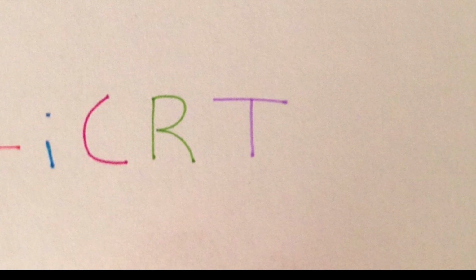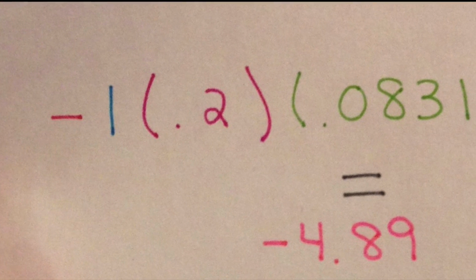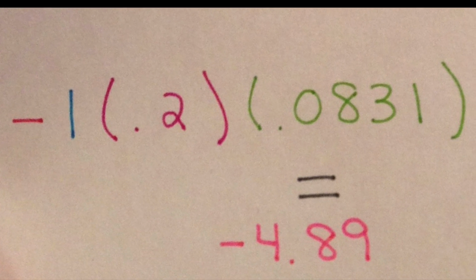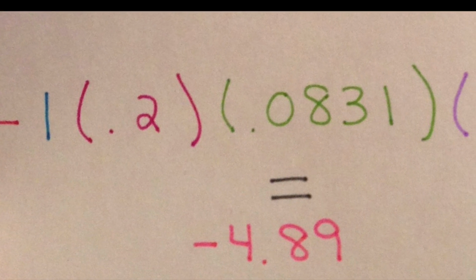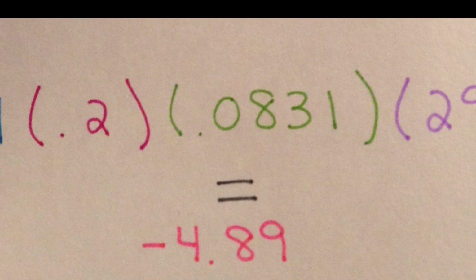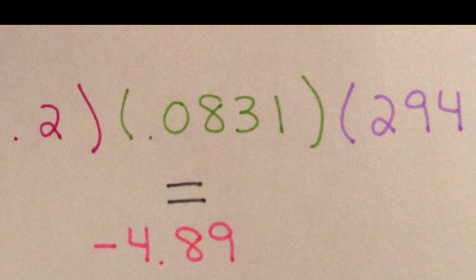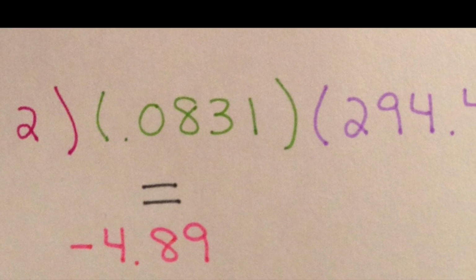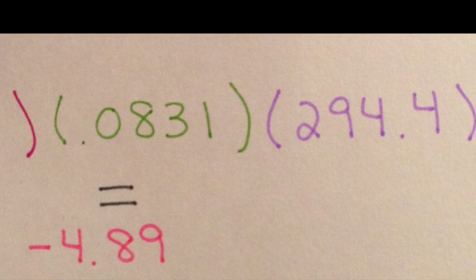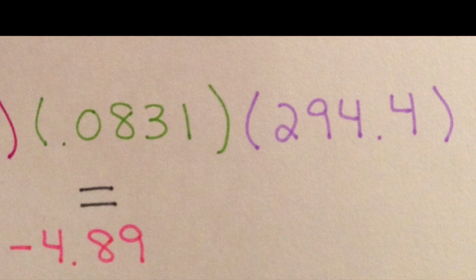In this case, the sucrose has an ionization constant of 1. The molar concentration would be 0.2, or 2/10, based off the other group's accurate data. The pressure constant would still be 0.0831, and the temperature was originally calculated as 21.4 degrees Celsius, or 294.4 degrees Kelvin after it was converted. By plugging all these numbers into the equation, we can predict that the water potential of a potato cell is approximately negative 4.89.